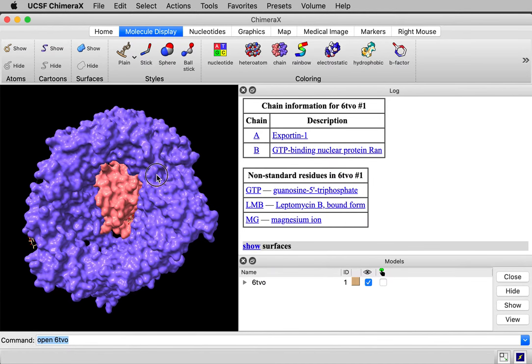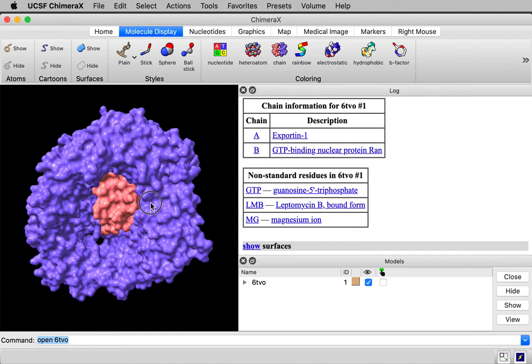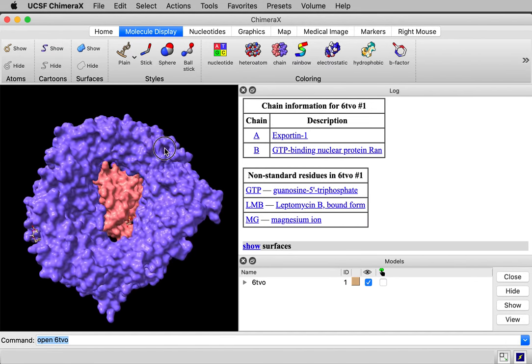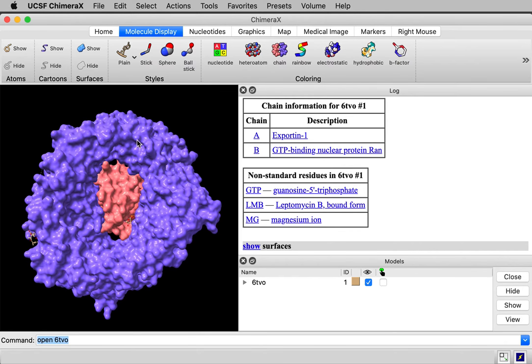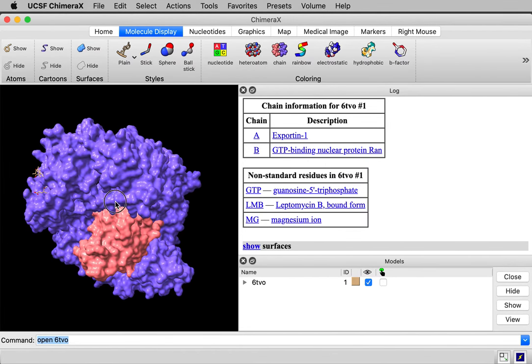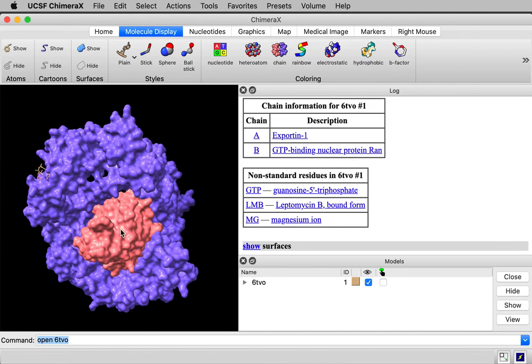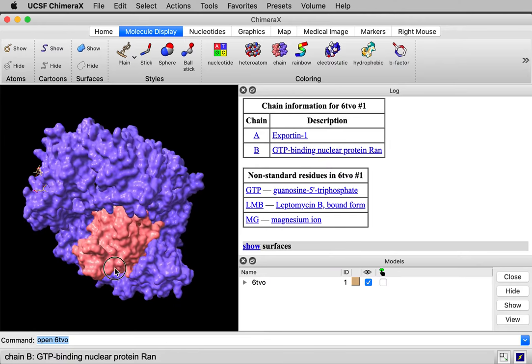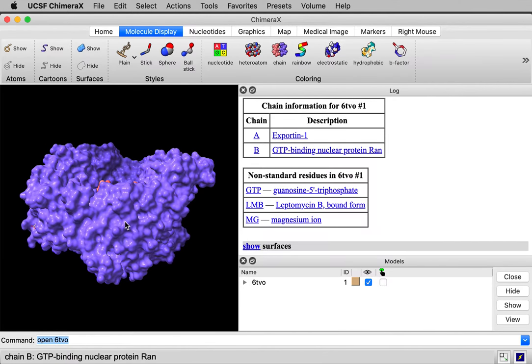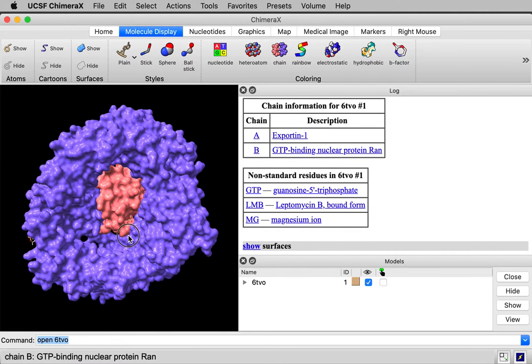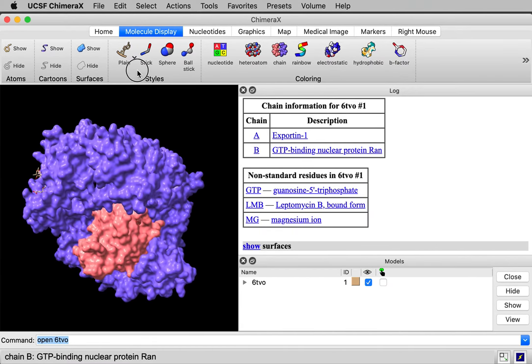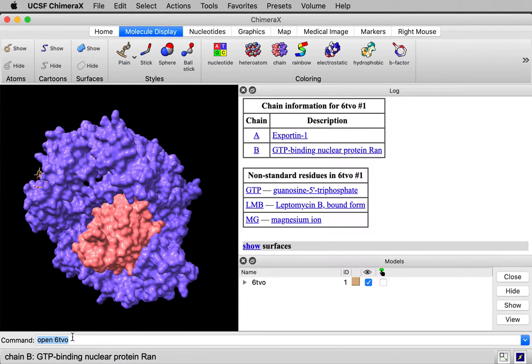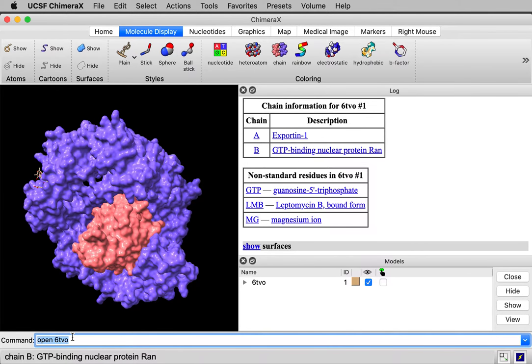The blue part here is the nuclear export factor CRM1. The pink is another protein that's important for doing the exporting, called RAN-GTPase. I'm interested in the electrostatics on the blue part here, so I'm going to delete the RAN-GTPase. That's chain B, so I can delete it by a command. I can say delete slash B.